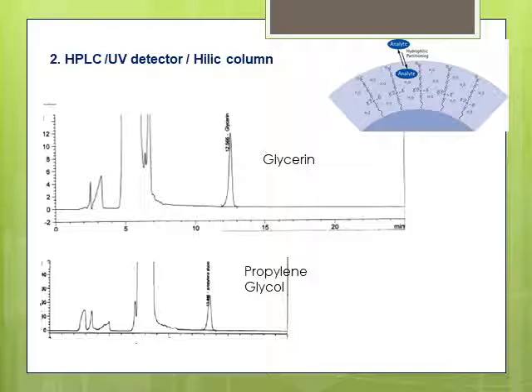This technique is very suitable for alcohols that have more than 2 OH units and don't have a long hydrocarbon backbone. If we are trying to separate fatty alcohols, the retention in the column becomes very sluggish, and they will elute similar to all other excipients. So this large peak at 5 minutes that we see is actually all the other excipients in the formulation that had very poor retention in the column.